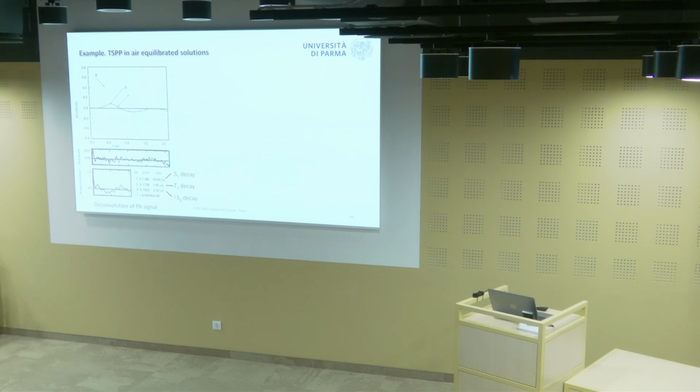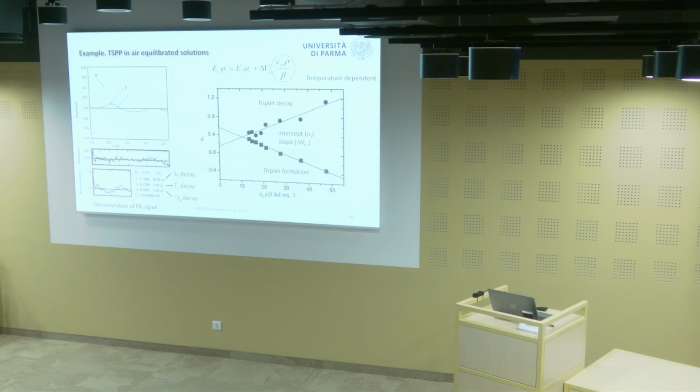And if you're able to do that, you can retrieve information on the energy content of each intermediate and the volume change that accompanies that. If you look at this equation, it's the same equation we had before, but it has been rearranged to expose here the amplitude of the deconvolution analysis. And here you have the heat release, and here the volume change.